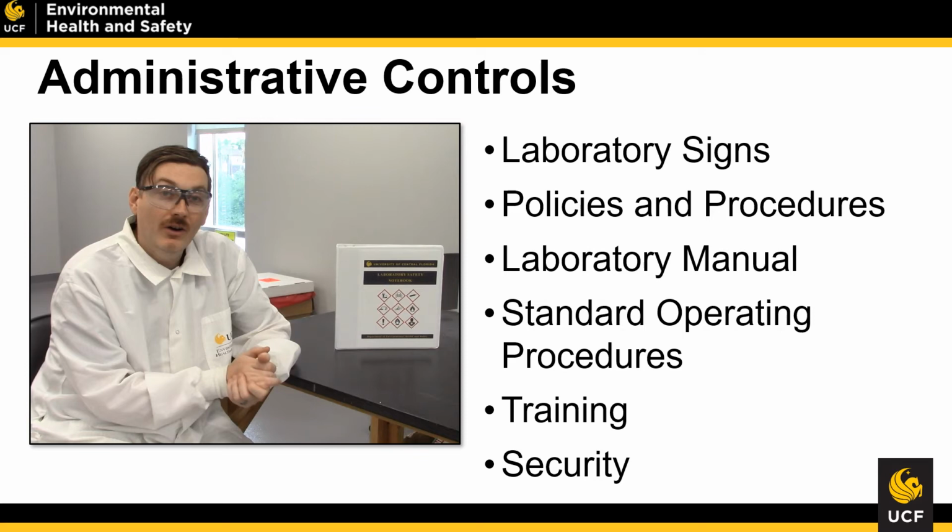And we will also provide you with additional training. Training opportunities will come up as annual refresher trainings or new training opportunities. As you're exposed to new hazards within the lab, new training requirements will be placed on you. Please do follow all training guidance and make sure that you're staying current on your training. We don't want to prevent you from your laboratory activities, but we also need you to maintain good safety practices, and training is one way that we do that.